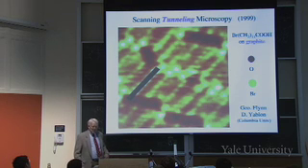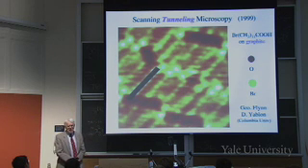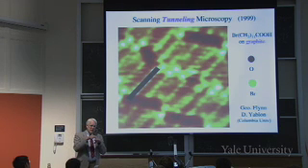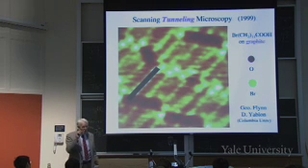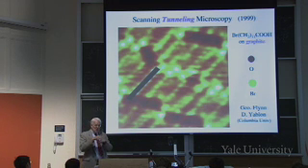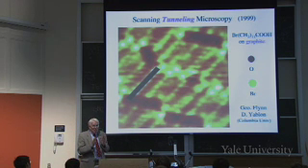Here's a scanning tunneling microscopy. This is done a different way. You don't reflect the laser light. What you do is detect the electrical conductivity through a layer. And if you have an atom there that is a good conductor of electricity, you get more current through and less and so on. So as you scan now, this could be a really, really sharp tip where the tip is just one atom or a couple atoms. So now as you go across, you can feel things that are much smaller laterally, okay?